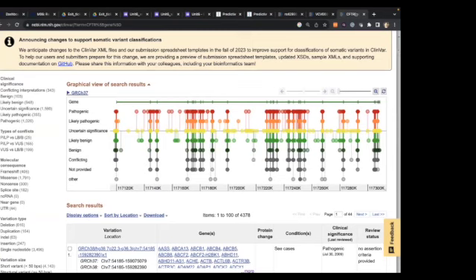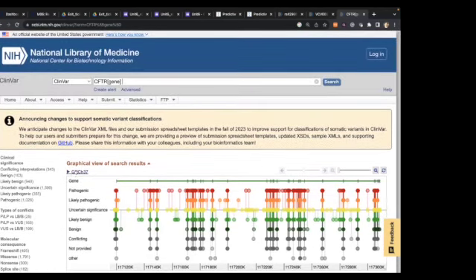There are many mutations: pathogenic mutations, likely pathogenic mutations, uncertain significance, likely benign, conflicting evidence, not provided, other. Do you see that it's GRCh37, which is not hg38? So be careful. If you just click it, it will change into the hg38 version.